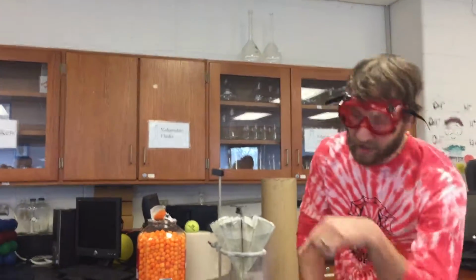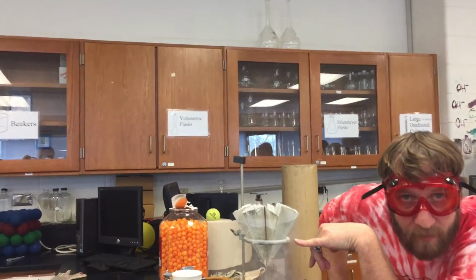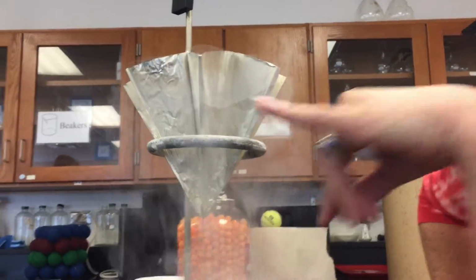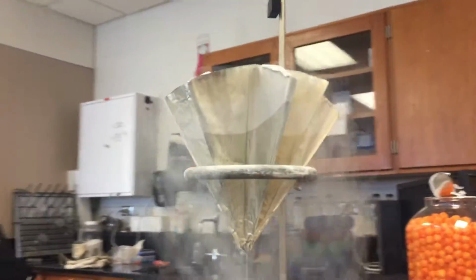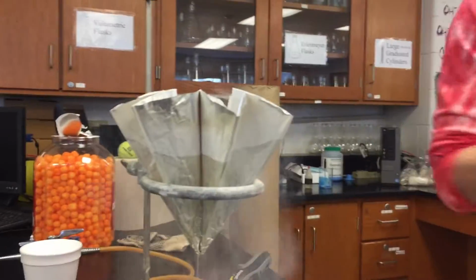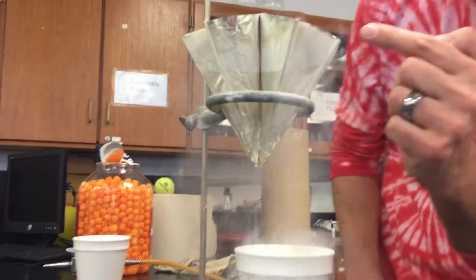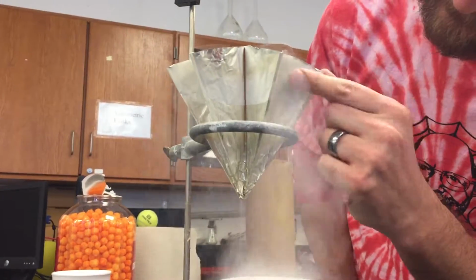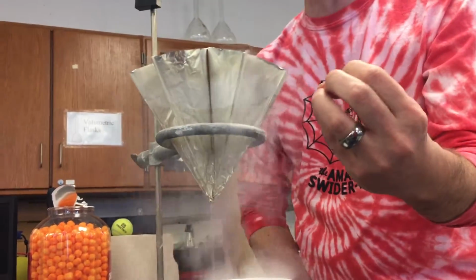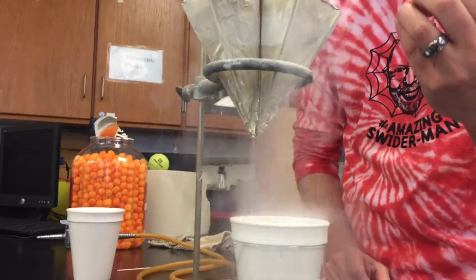Now, if you look at the side of this, cameraman, bring it in. We can actually see this weird little up and down front here. It looks like the outside of this funnel is wet. It is, but the outside of the funnel is not wet because of water. This is so cold, water is freezing instantly. You see the frost on the outside? The moisture in the air is actually turning into solid because those hydrogen bonds are so strong.